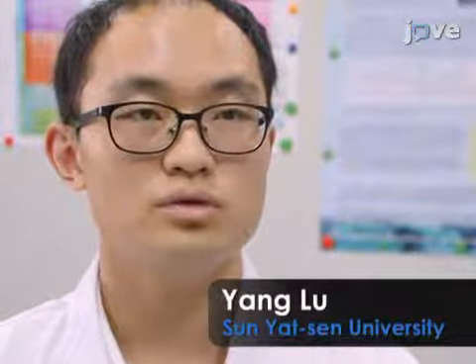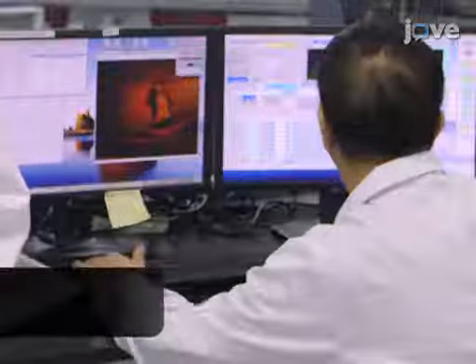The main advantage of this technique is its high resolution and precision, which allowed us to analyze the sulfur isotope composition of a pyrite on microscale. Demonstrating the SIMS analysis procedure will be Zhiyong, a technician from the SIMS laboratory at the Guangzhou Institute of Geochemistry.